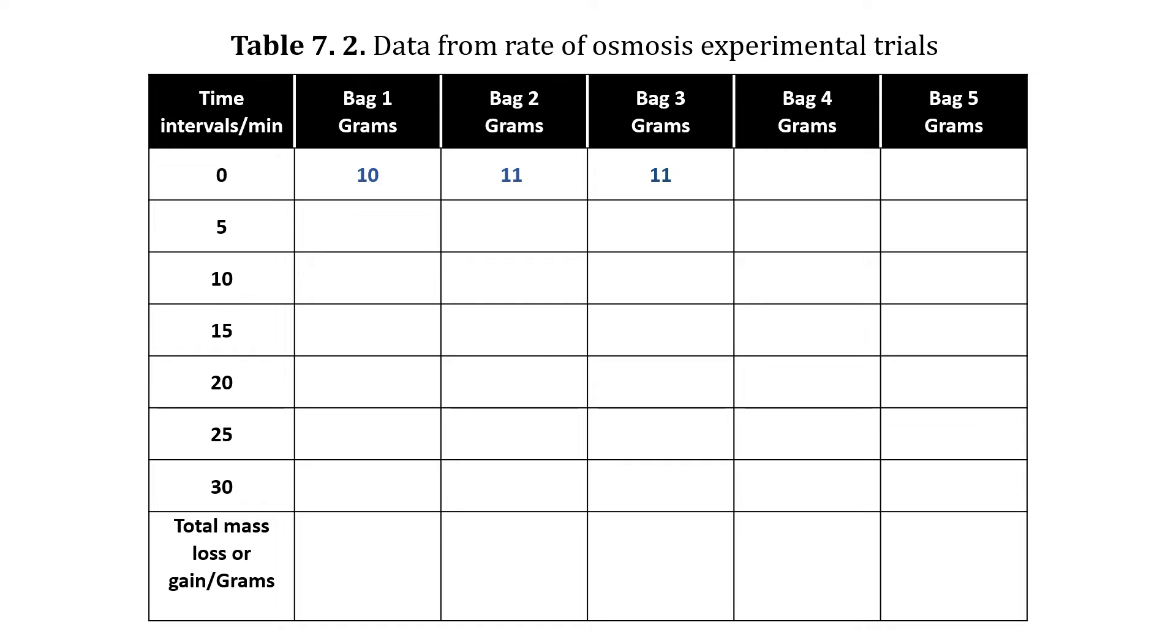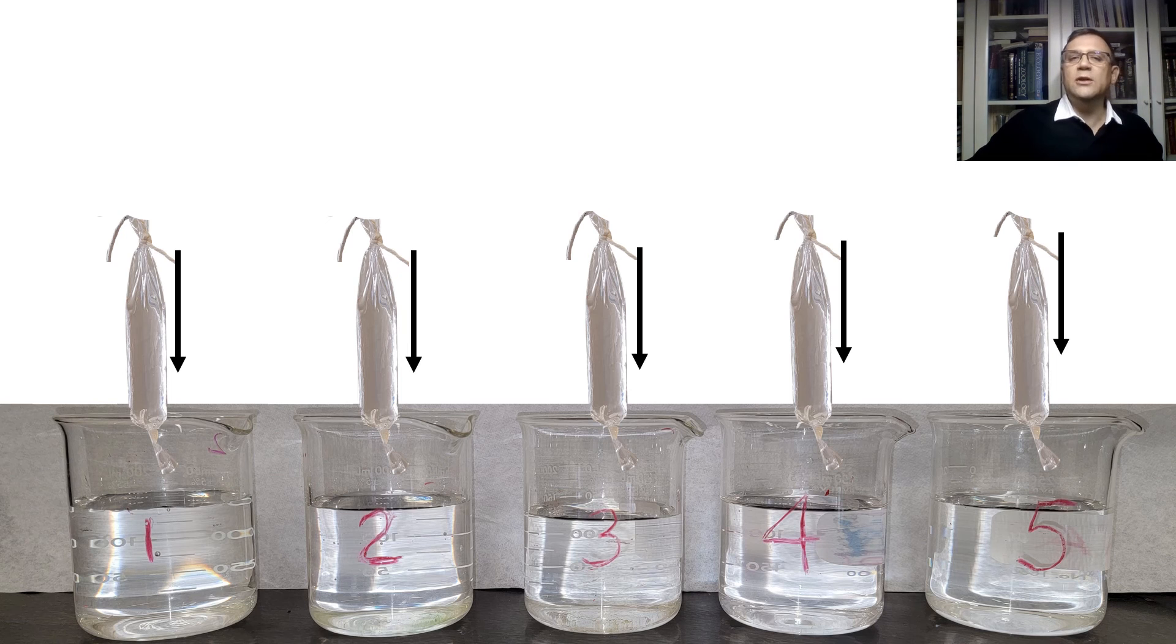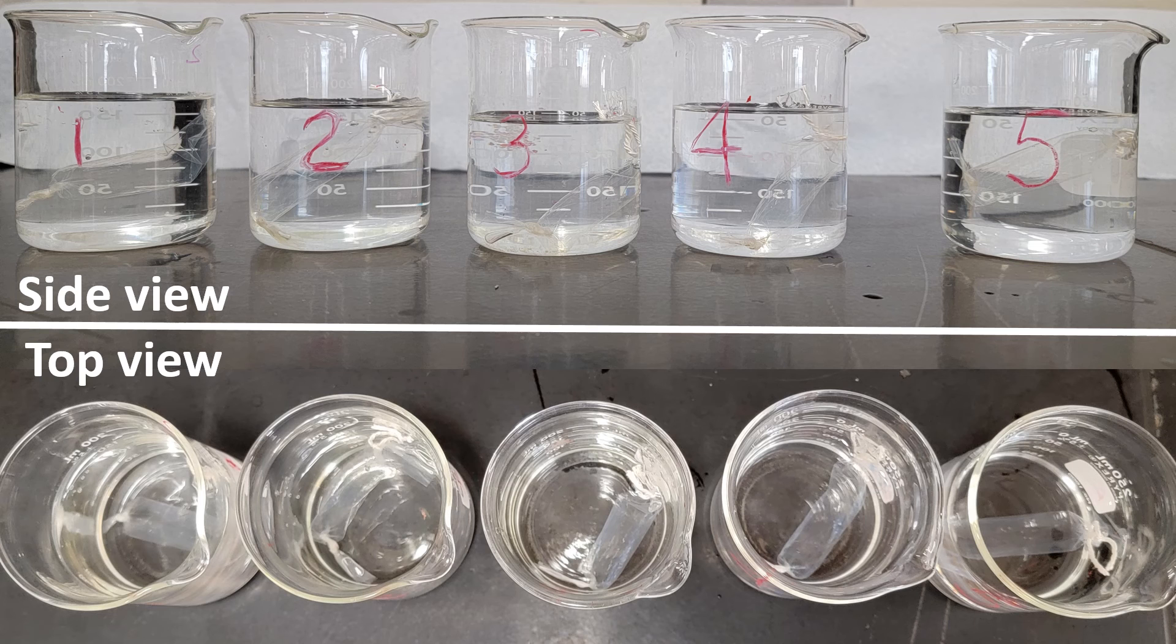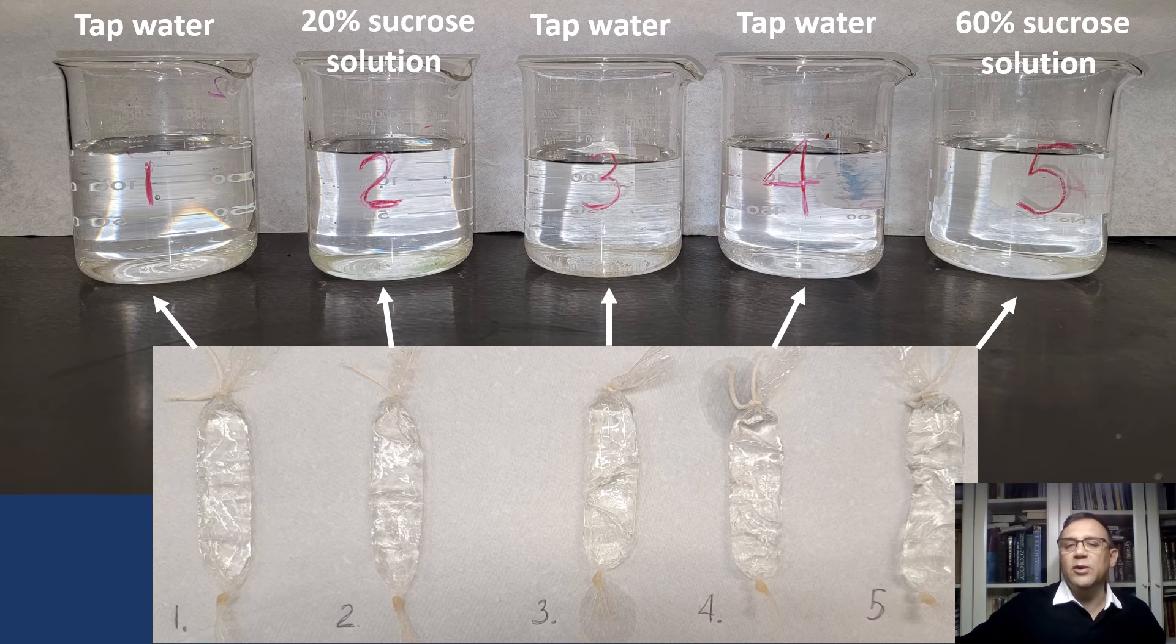Next, we will measure and record the mass of bags four and five. Bag four is 13 grams. Bag five is 10 grams. Now we need to simultaneously submerge all the bags into their respective beakers and leave them there for five minutes. Here is the side and top views of our experimental setup. Note that each bag should be fully covered by the solution in the beaker. After five minutes, carefully remove the bags and place them back to their original spots next to their corresponding beakers.